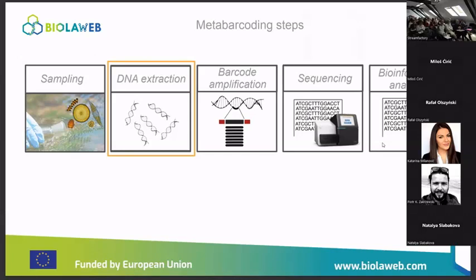Yes. They can be present at different steps of the metabarcoding. For instance, in the sampling, you can take a device that you use for the sampling, for instance a bucket or a filter, and then try to extract DNA from that filter that wasn't used in the field, and see if you already had DNA at the beginning on this filter.